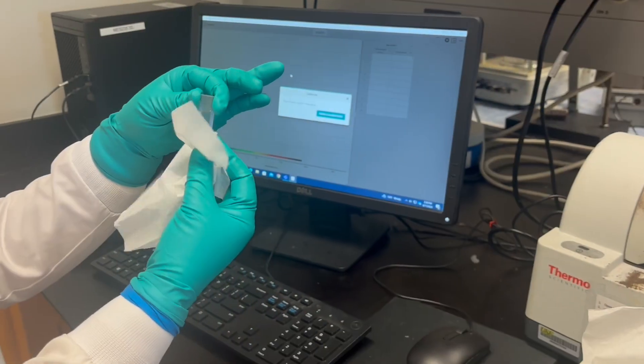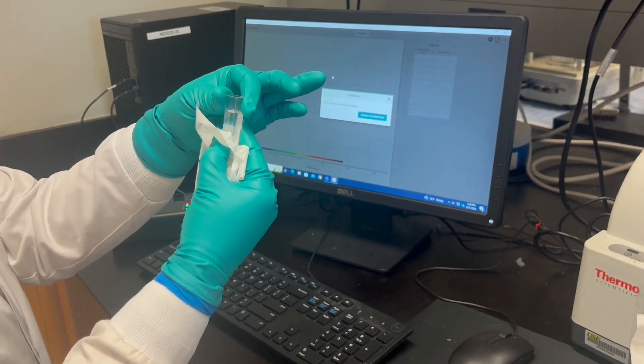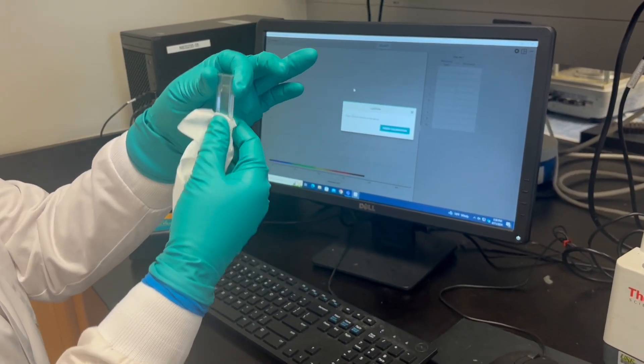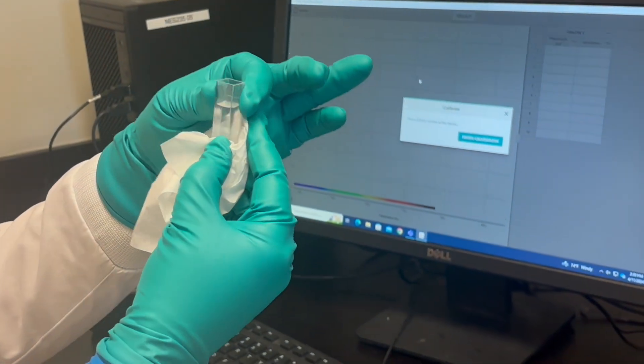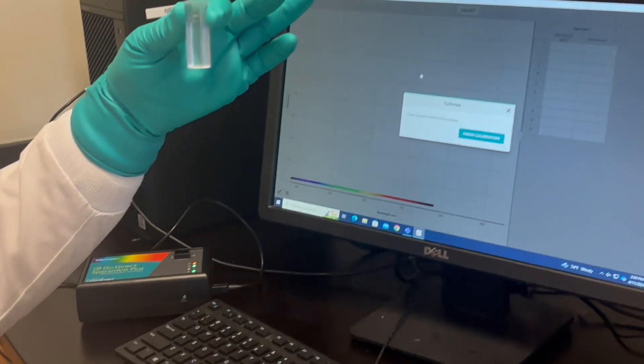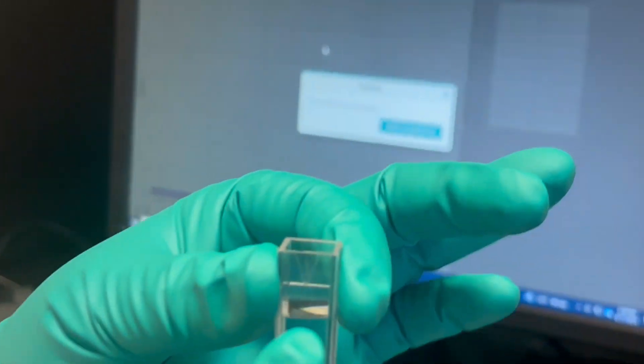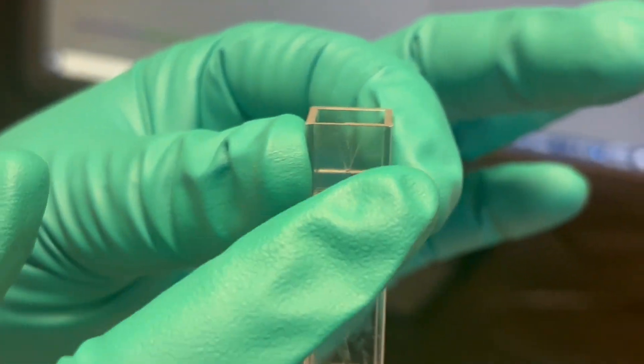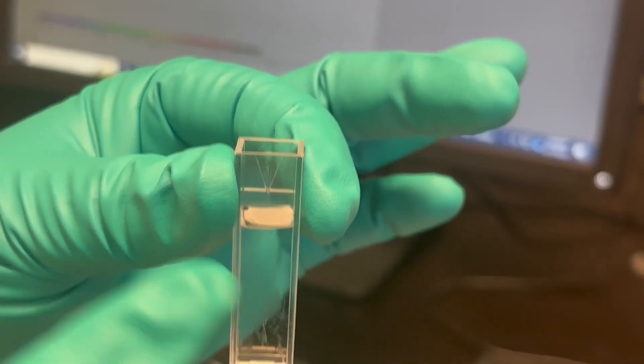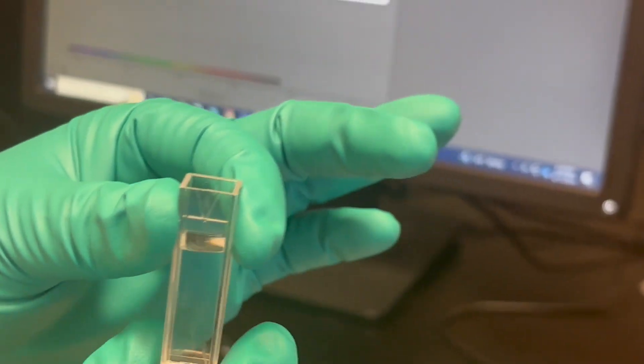And make sure we wipe it down with a Kimwipe so we don't see any fingerprints on the side. So that's good enough. And then you'll see on your cuvette, I don't know if it's showing up on the video, there's a little triangle that tells you how you should orient your cuvette.